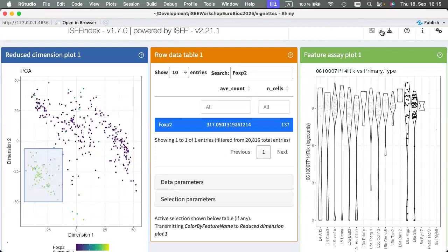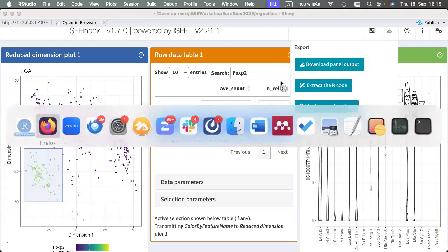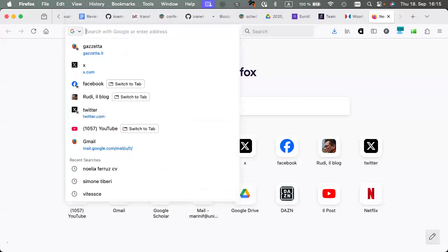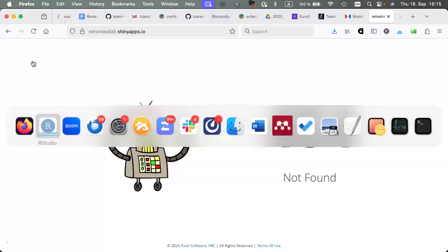And then again, the magic wand is there for you to take a snapshot of this in terms of code. You can imagine that actually you are done with your project and you want to talk about these beautiful data sets and collection of data sets that you have. Someone was brave enough, or not just brave enough, but proud enough to have the idea to say, oh no, not now. ShinyApps.io. You had one job. Okay, I might have a screenshot of that.